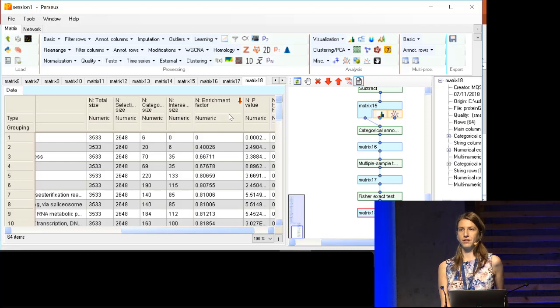I didn't filter, I kept the entire matrix. No, for valid values. But even that is okay, it doesn't change anything. Other guesses? That is also okay. I mean, you can't do statistical analysis unless you have enough data to do it. And maybe significantly up or down regulated?